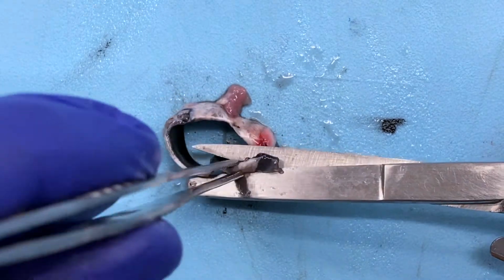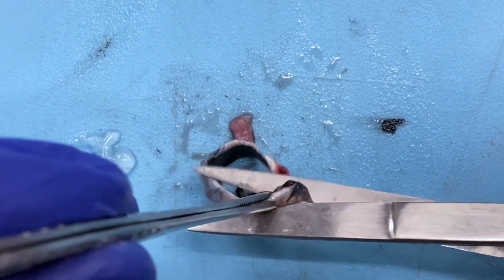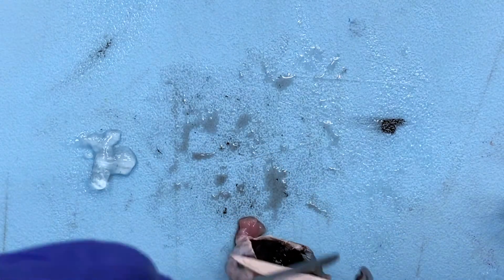I'm starting on the side that was closer to the limbus. I'll make sure I keep that optic nerve intact.